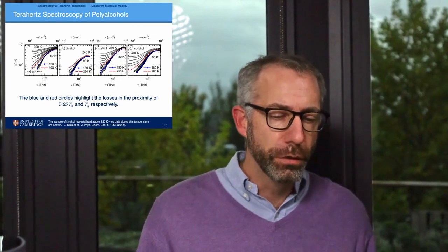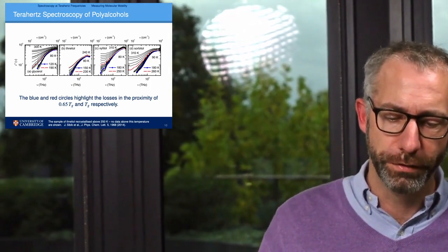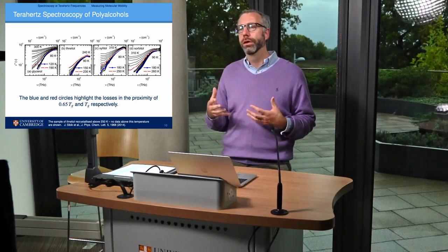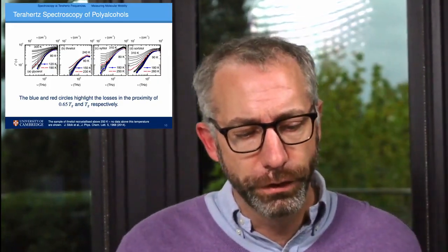Now, even though there is no significant shift in the peak position, the absorption, or in this representation, the loss of the imaginary dielectric part, they change considerably, in particular as the temperature exceeds the glass transition temperature, Tg, which is here highlighted in red. Now, upon cooling, a molecular liquid at Tg undergoes the transition into the glassy state. The time required for relaxing the structure of the system begins to exceed 100 seconds. That's an entirely kinetic process, which is universal to any disordered material, and can of course be studied by a wide range of experimental techniques.